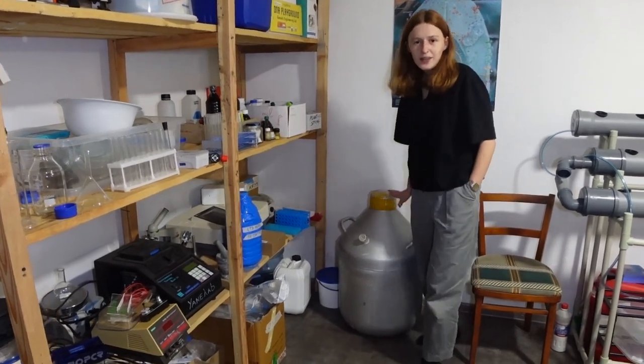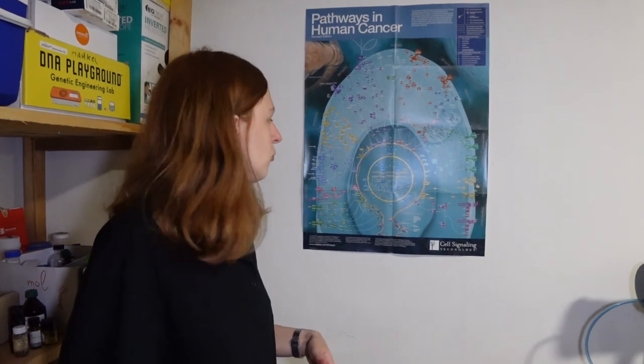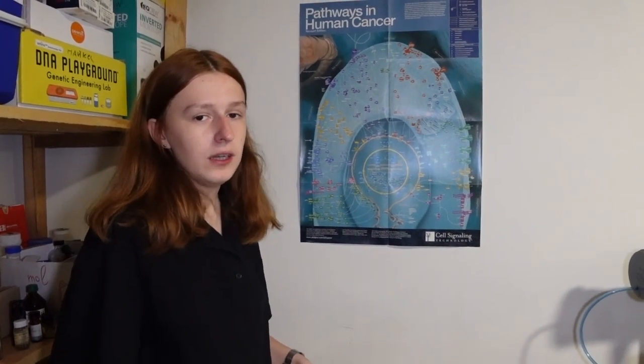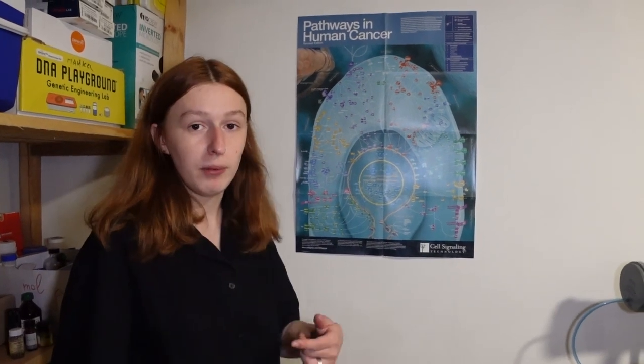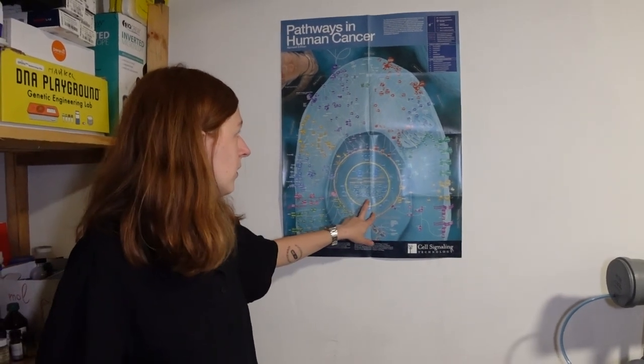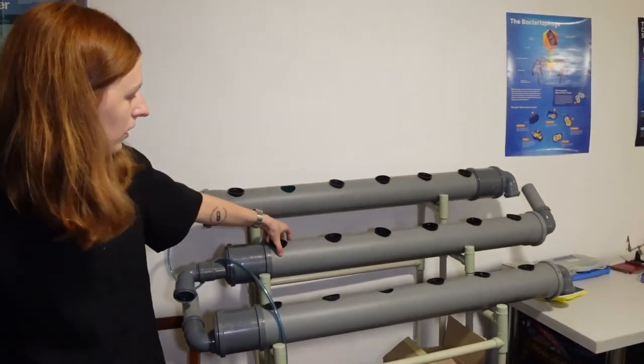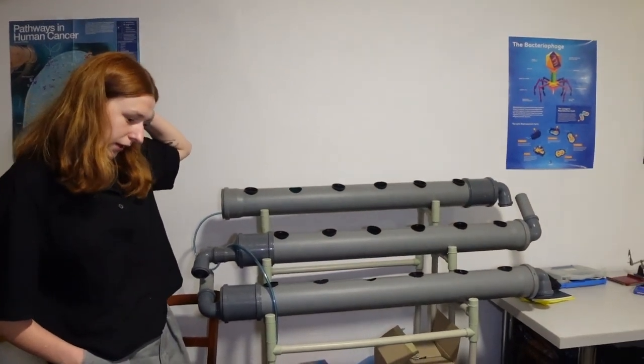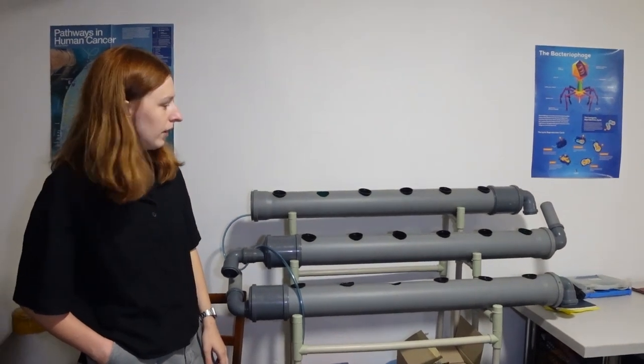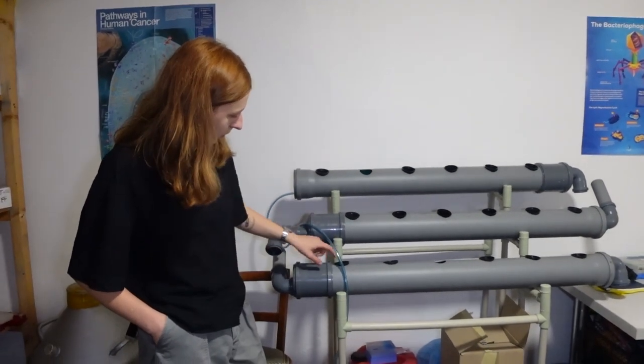I have some science posters here as well. This is Pathways in Human Cancer and Anna from our lab, she worked on cancer and CRISPR in a Korean institute. She brought this beautiful poster, I don't understand most of it but it's pretty. Here I have a hydroponic station, right now it's not in use but we've been growing some stuff like basil and salad leaves. It's also custom made from tubes.